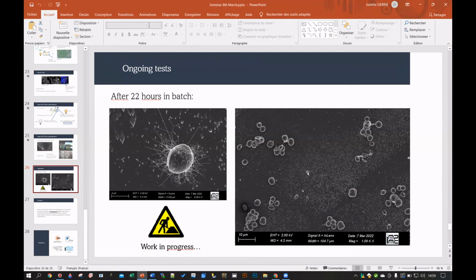with cells very highly concentrated to the solution. And we noticed that after 1 day, they managed to attach, to stick to the surface. We don't know if they were still alive or not. So it's pH 10, so I guess they are not so bad.